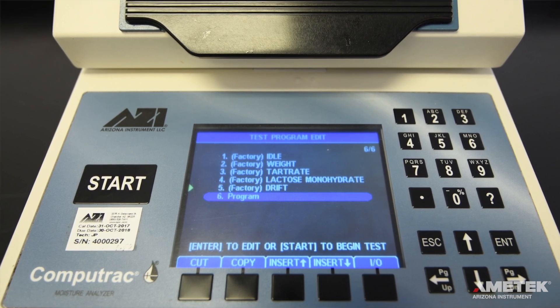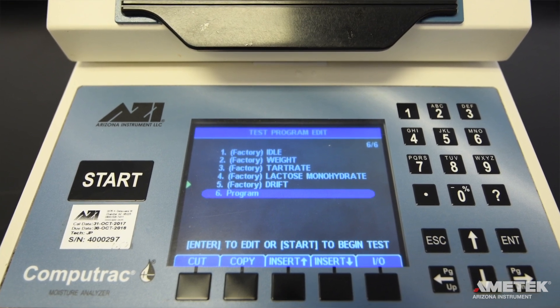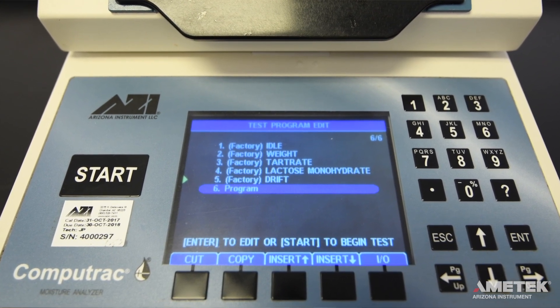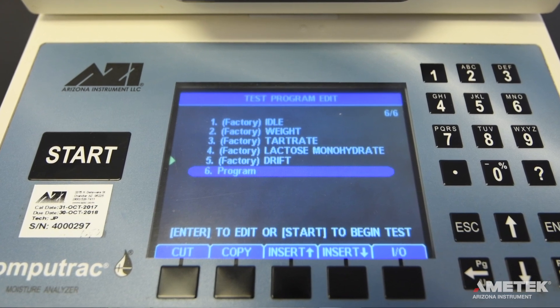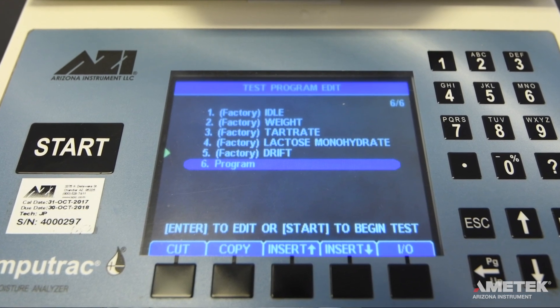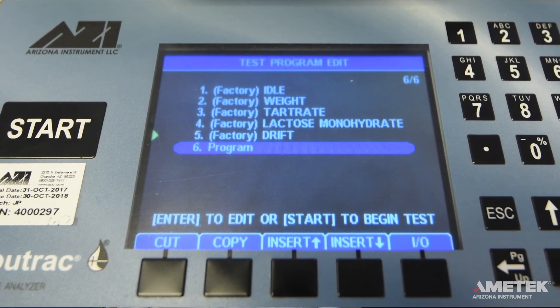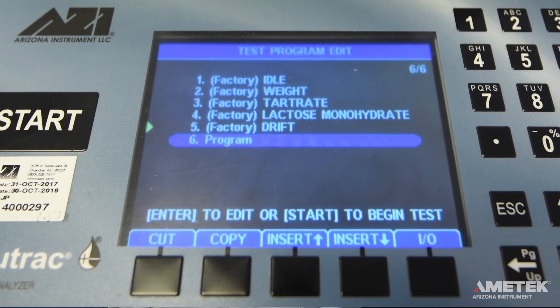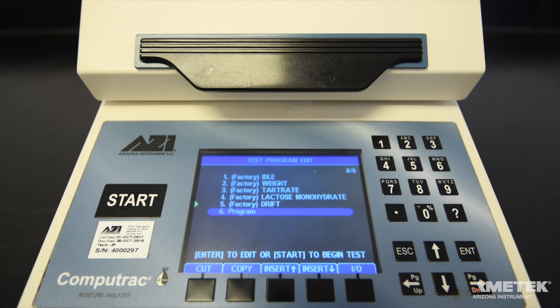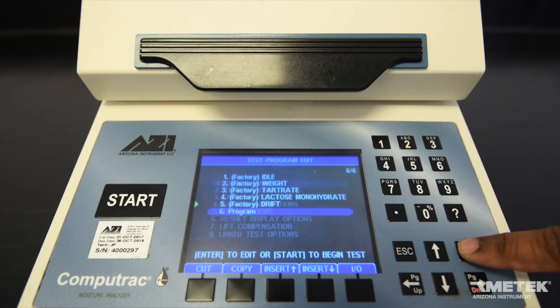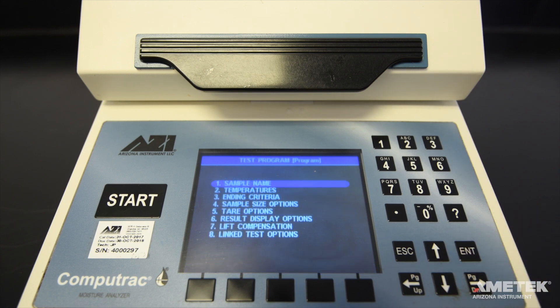Note that rather than starting from scratch, you can copy an existing program by selecting it and pressing the Copy button, then pressing the Insert Above or Below button to paste the copy into the list. Use the directional keys to highlight the new or copied program and press enter to begin editing the program.